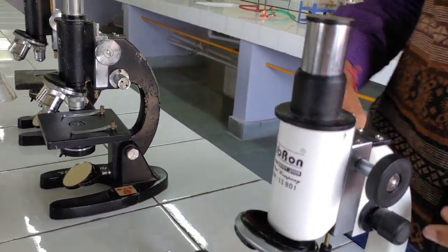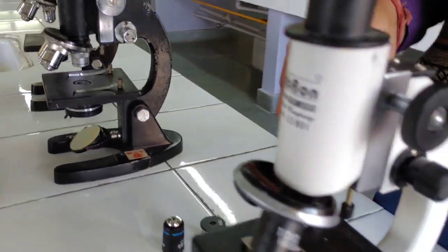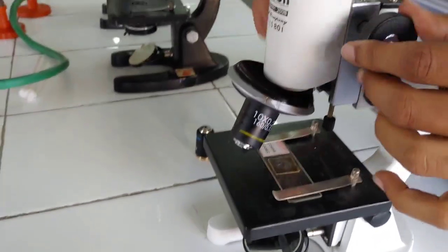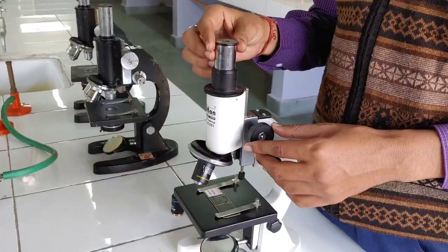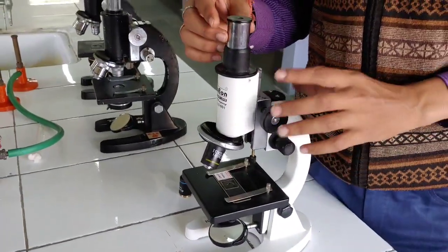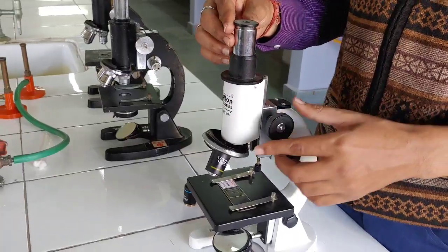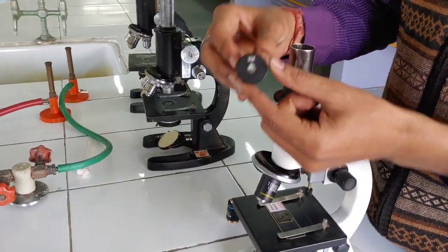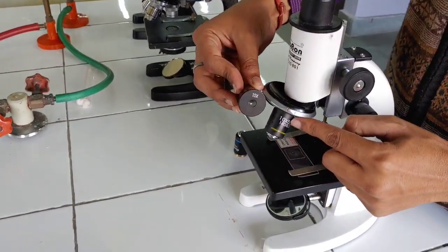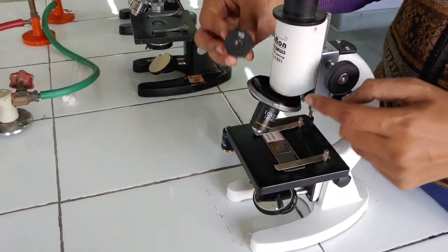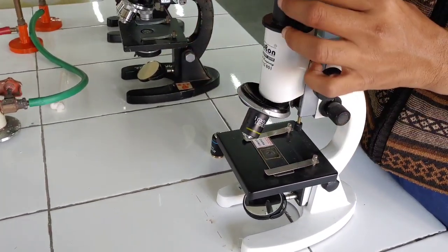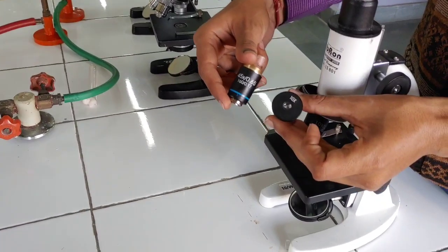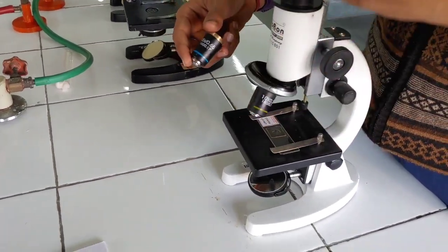Apart from this, there is another objective that can be present within the revolving nose piece, is the 100x which is oil immersion, though it is not present in this microscope. Now, what is degree of magnification? The degree of magnification is the times of multiplication of 10x, that is the eyepiece objective, and 10x of the nose piece. That means 100x total is the 100x. Similarly, you can multiply 10x with the 45x which will become 450x. That is also the degree of magnification.